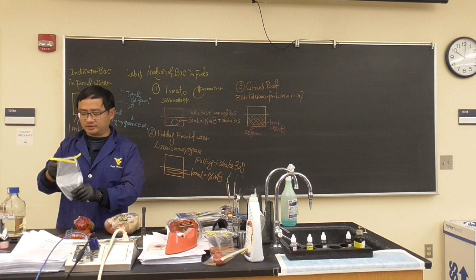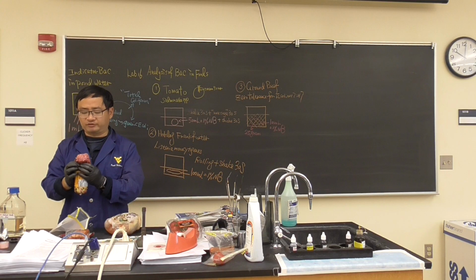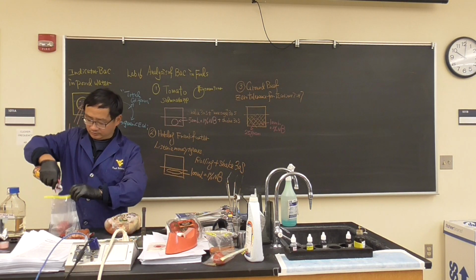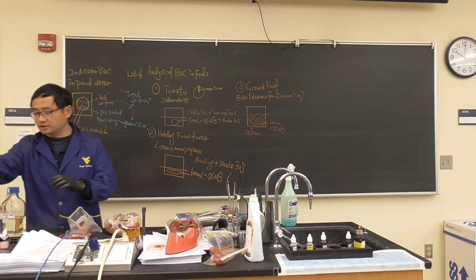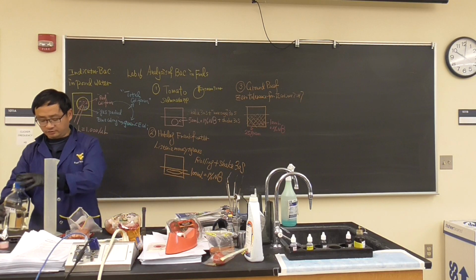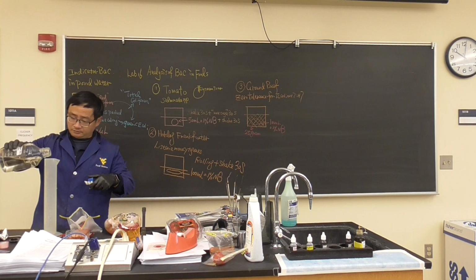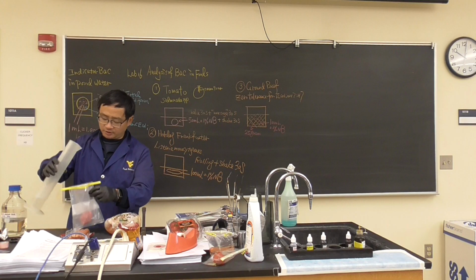I did this for lots of years, so I know approximately this chunk is about 25 grams. So we add it in, and then we add 100 ml.